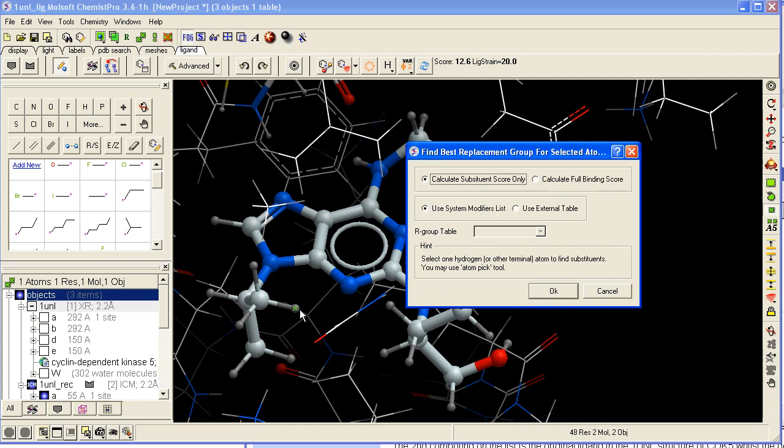You can use the modifier list that comes with ICM, or you can use your own external table of modifiers.